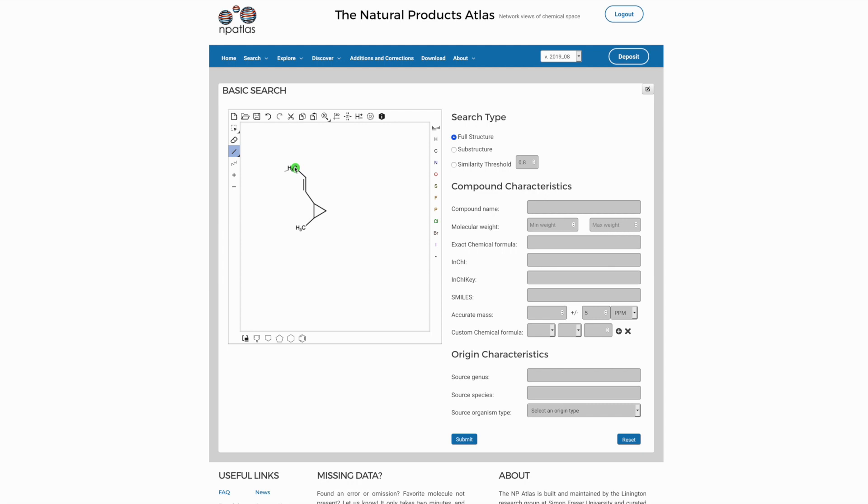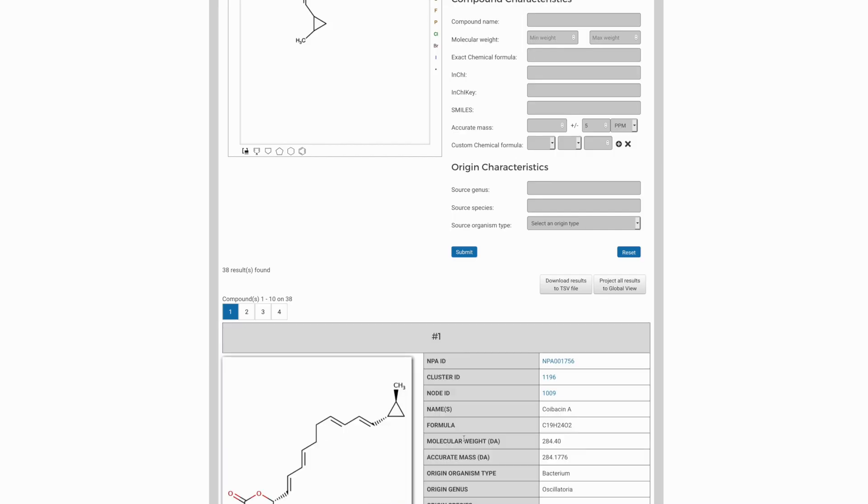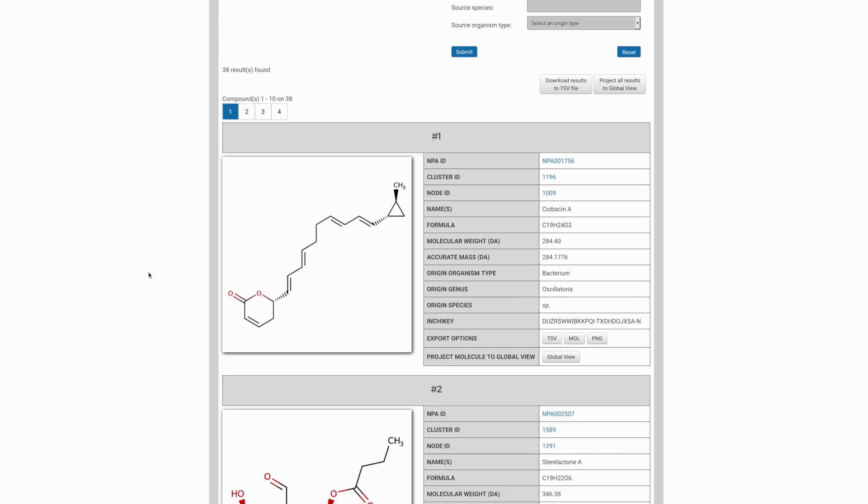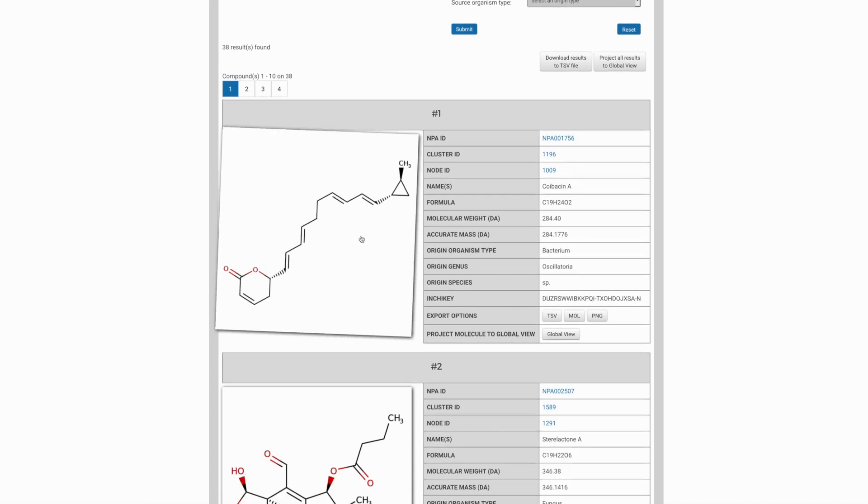it's possible to use this information with a substructure selection to find all the other molecules in the atlas which have this kind of connectivity. So if we submit this simple query, the atlas returns 38 possible hits. And if we look at the first in the list here, we can see that it does indeed contain the functional group we would expect.